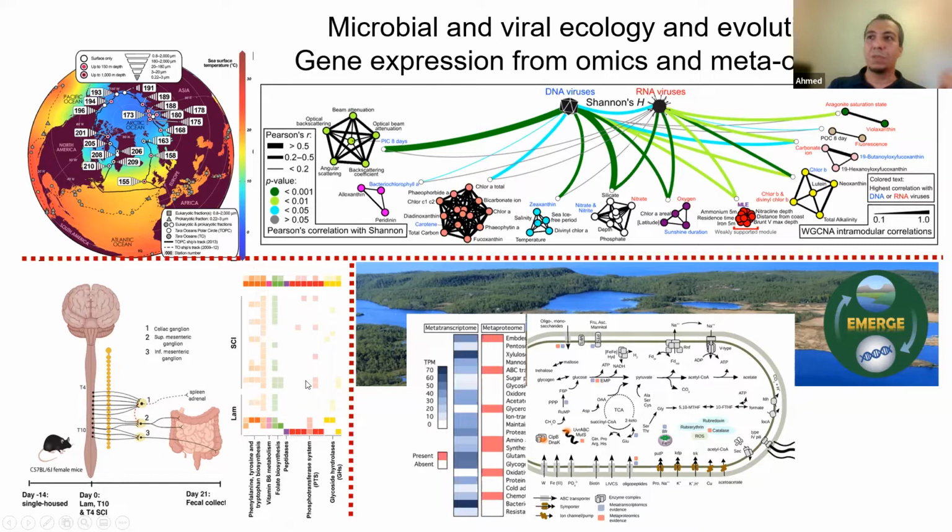You can even go beyond that and start to look at genome-resolved mapping of the expression of these genes in the metatranscriptome and the metaproteome, and map that to your genome maps. So there are a lot of things that the tools we're going to talk about today can help you do. They can simplify things a lot for you, so that you can invest your time in the biology rather than trying to sift through the massive data to find the needle in the haystack.